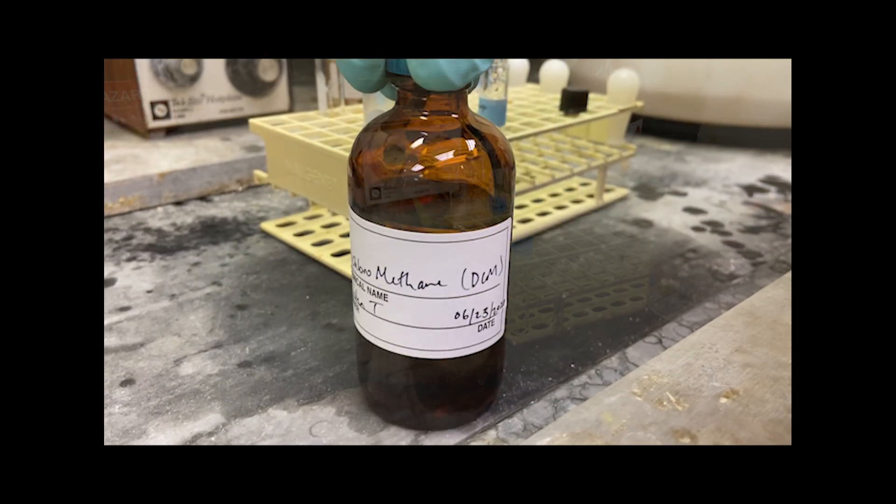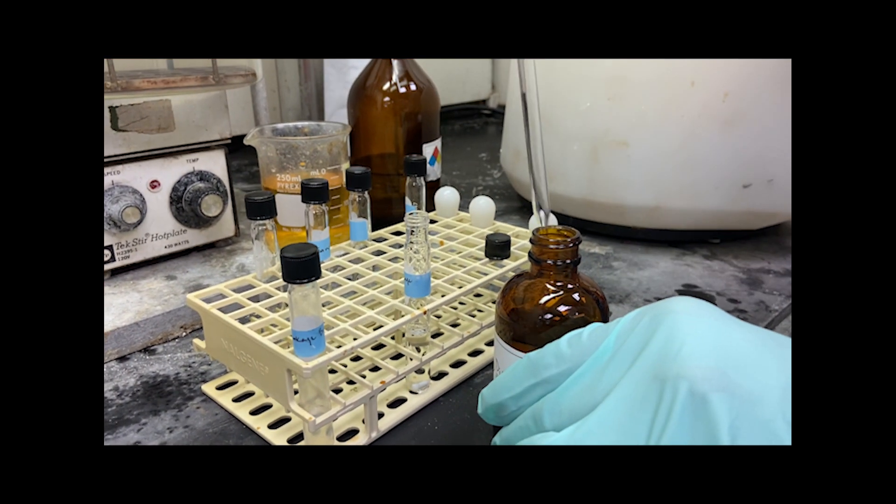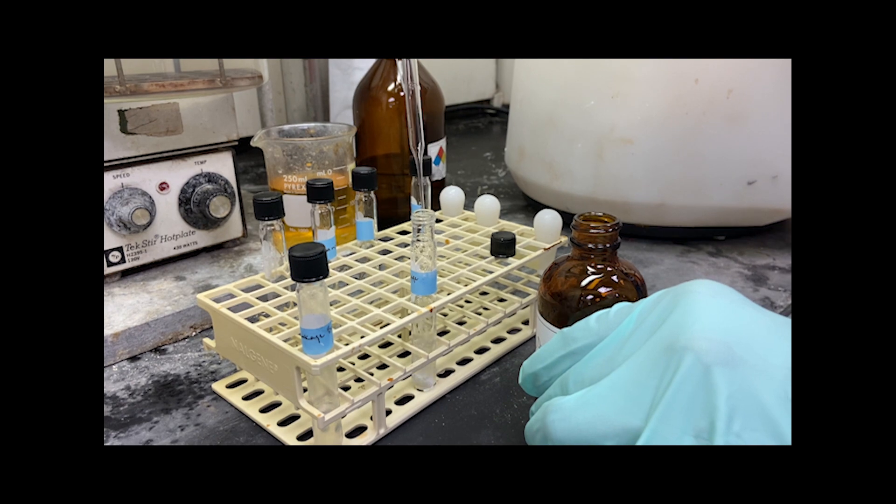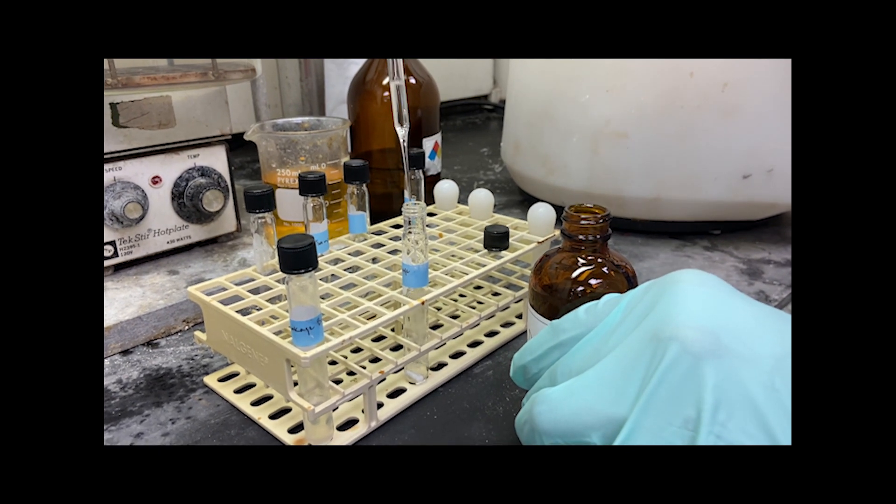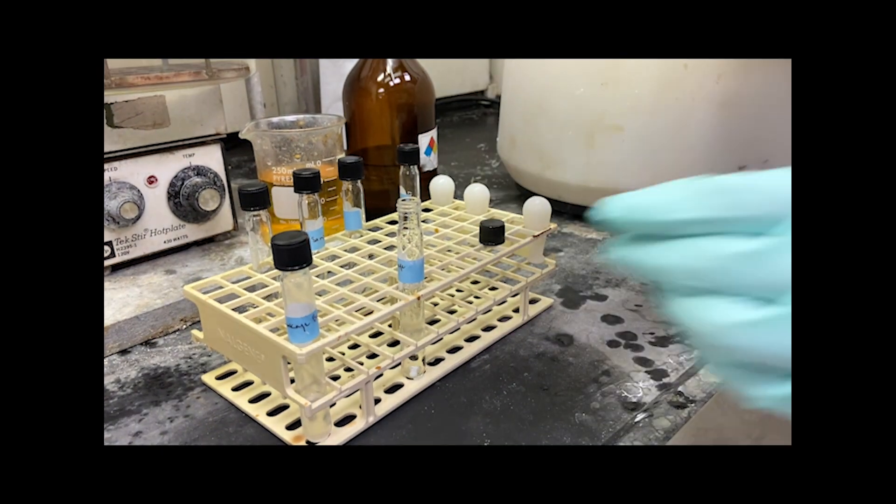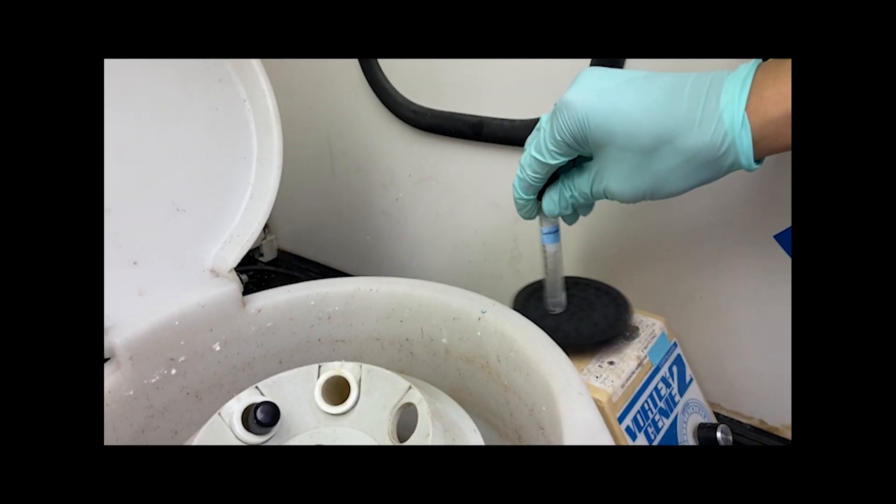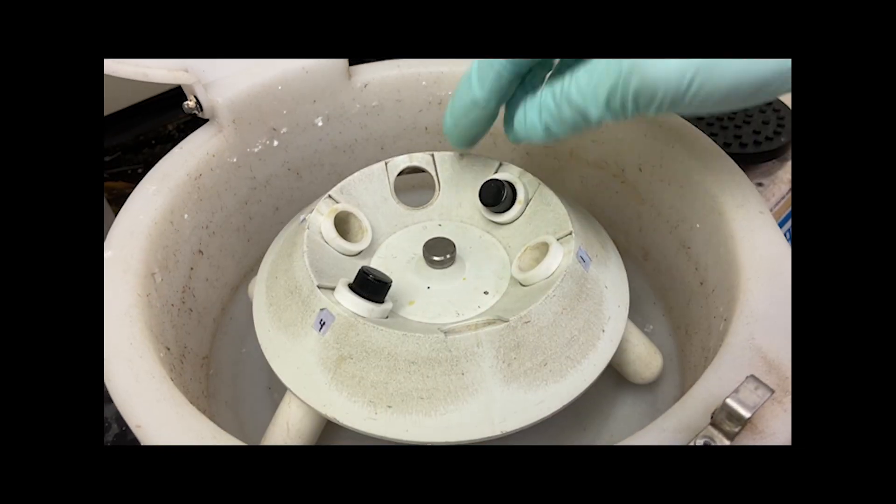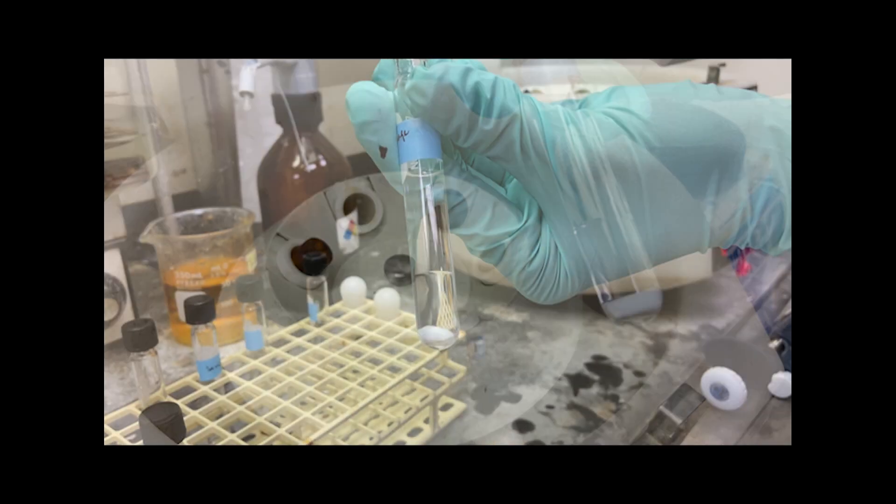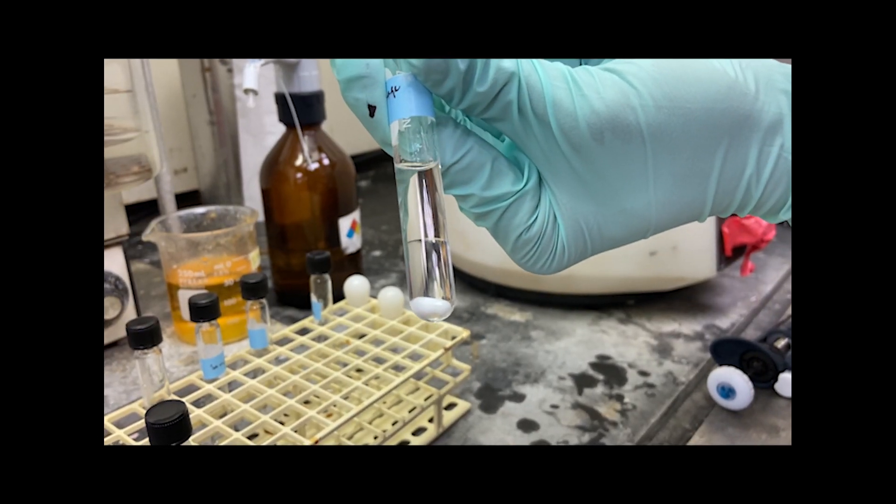Next, 2 milliliters of dichloromethane, or DCM, is added to the solution and the sample is vortexed and centrifuged. Centrifugation should be between 30 seconds to 1 minute. The top water layer is removed, washing the sample.